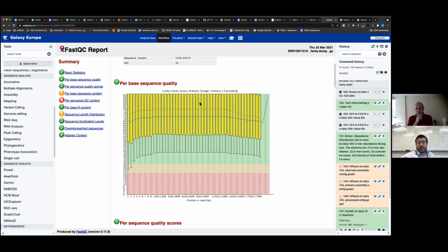You see a pretty flat line. That's a very good point. I always found this plot a bit misleading, because what they did is show you the first 10 bases, then a range of 500 bases, then big compressed ranges. This is made, I think, because it doesn't matter too much if you're looking at short reads. They are still doing that, so you have the first 10 bases, then 20, 50, and so forth.